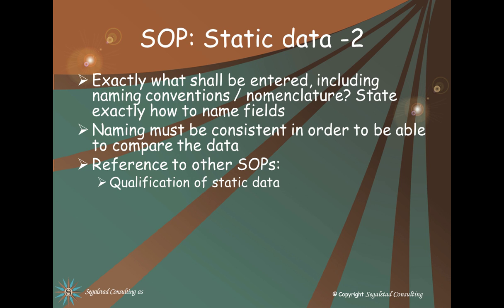So the result was that with 12 different ways of writing weight percent, 11 had to be changed. And 11 groups of people were unhappy about this darn LIMS system that did not write weight percent the way they wanted it to.